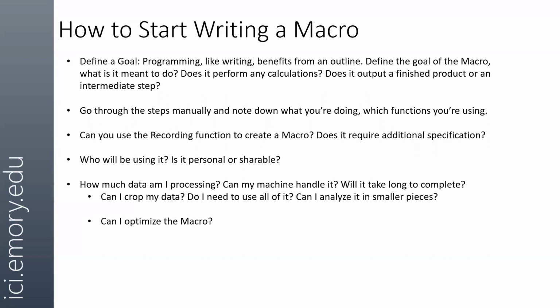Do you need to do any filtering? Do you need to do any deconvolution? If so, how would you do it? And then only after you've reached the point of how you would do it technically by hand do you want to create a macro to do it. Because at that point, you're translating your understanding of how to analyze this data into the code that the computer, or that Fiji, the macro language of Fiji, will use in order to get that same result. And it's generally pretty easy to go from one to the other, but there are instances where it could be troubling.